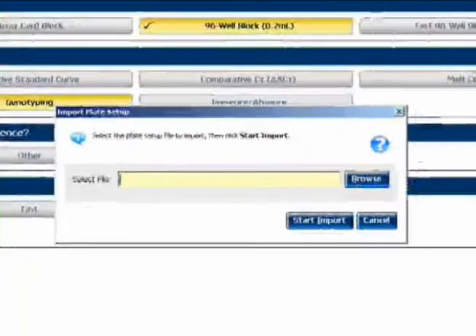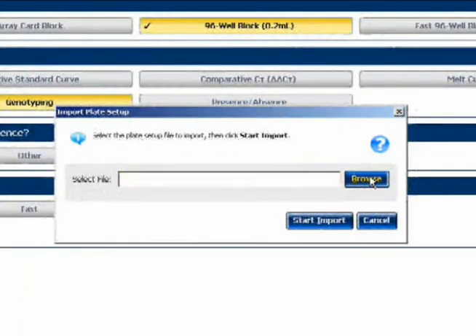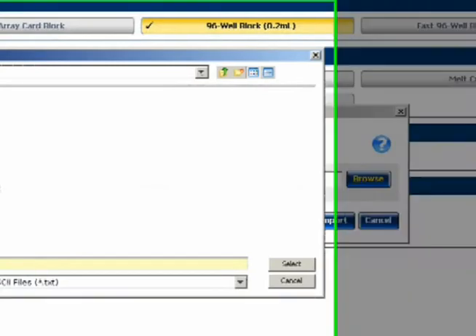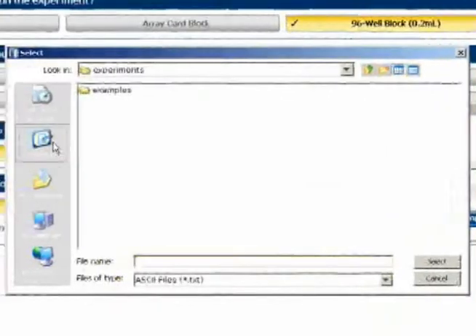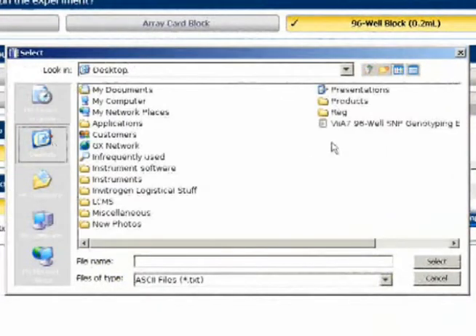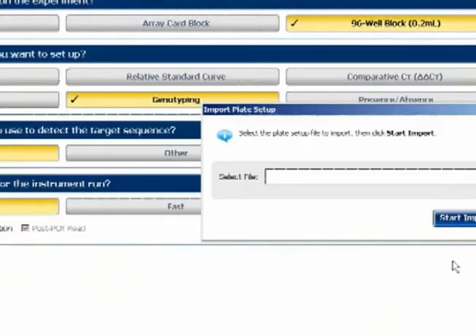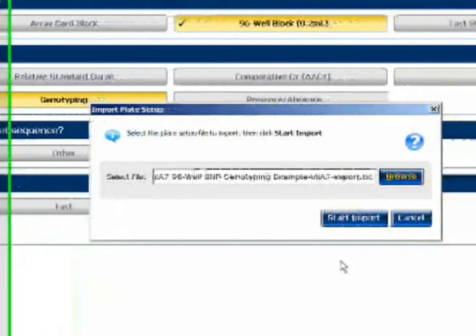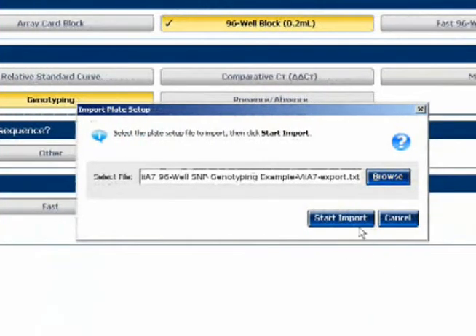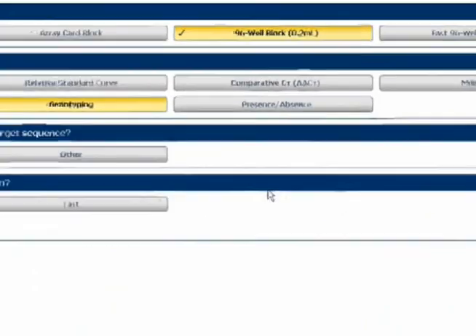I go to Import, Import Plate Setup. I could also use the File menu to do this, of course. And I navigate to the file we just saved. Select it. And Start Import. And that's it.